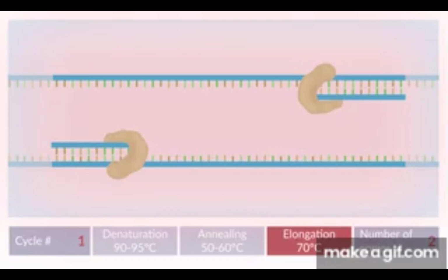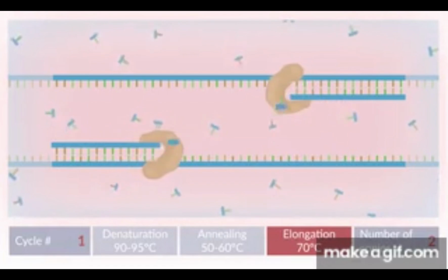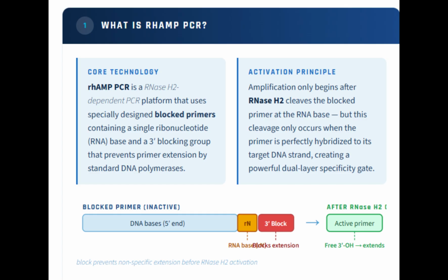False positive results have always been a challenge in PCR-based genotyping techniques, especially when detecting rare variants in a genome. In clinical and research settings, even a single undetected or incorrectly identified allele can significantly affect disease diagnosis and treatment decisions. Therefore, accuracy in distinguishing true variants from background noise is critical.